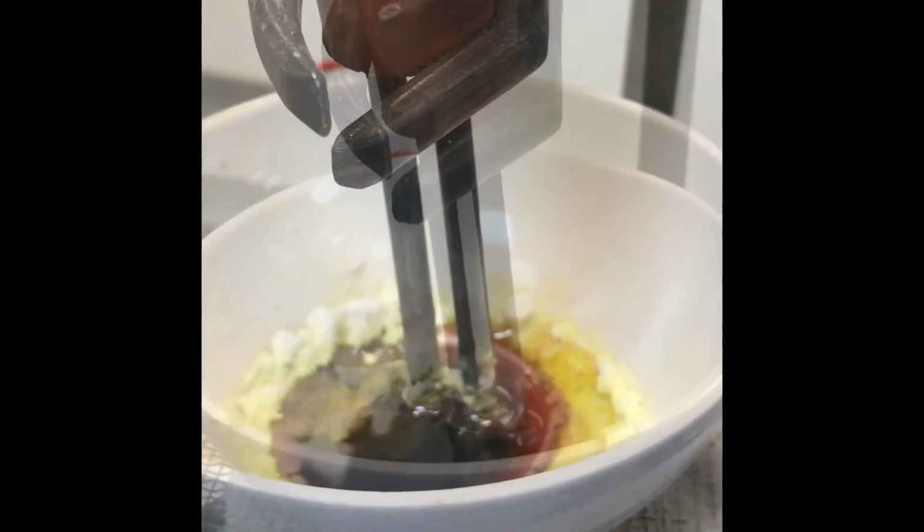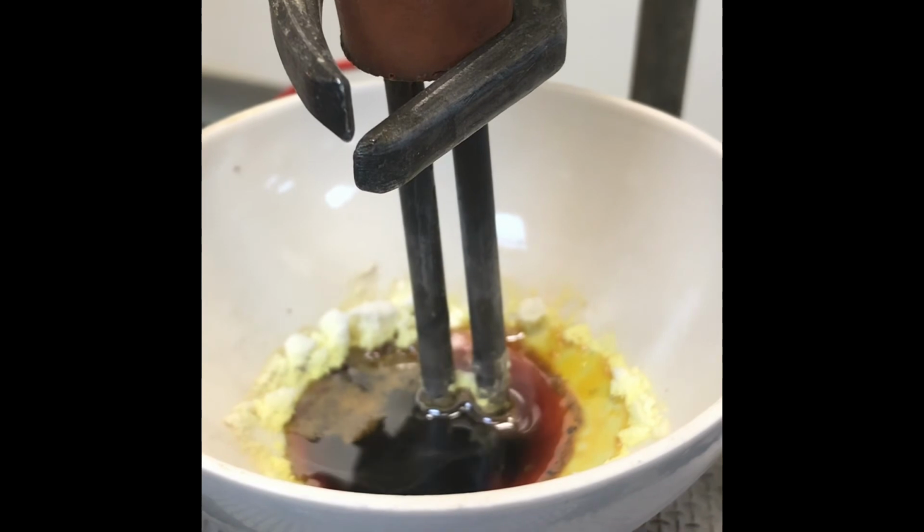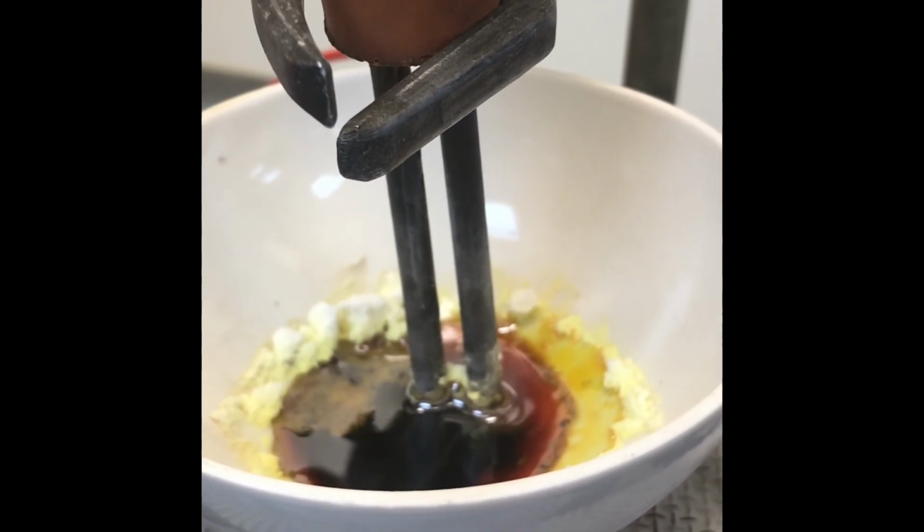At the positive electrode, oxidation is taking place where the bromide ions are losing electrons and forming bromine gas. That's the breakdown of lead bromide using electricity.